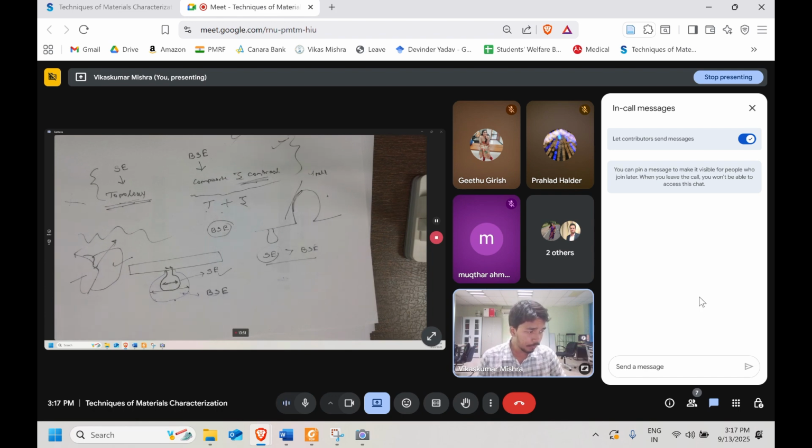From that angle, if that feature is tilted from the incoming electron beam, that is how it is going to affect the image, and based on that we get the contrast. Now if you are talking about tilting the sample itself, that is something we have to check, because I did the SEM, SE and BSE till now, and I don't tilt the specimens.